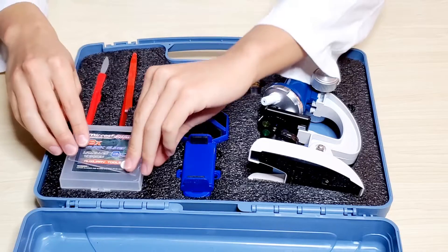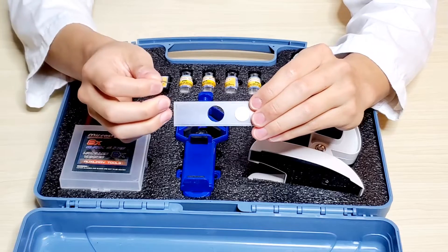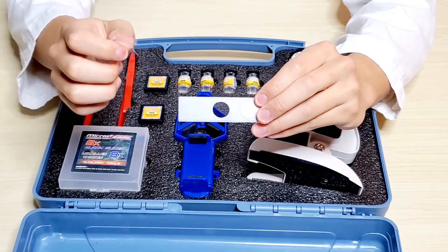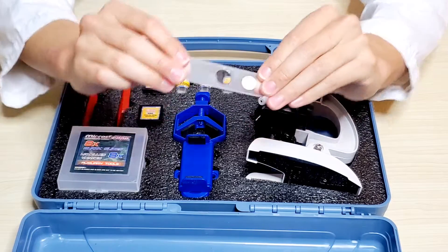To prepare your slides you would need to get a clear sticky tape. Collect your sample — for example, a hair — and just place it onto the center of the slide, then place it into your microscope.